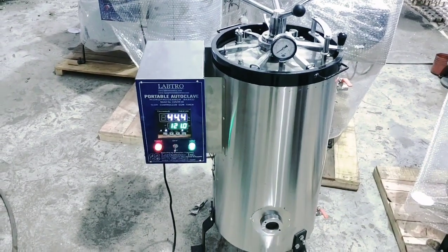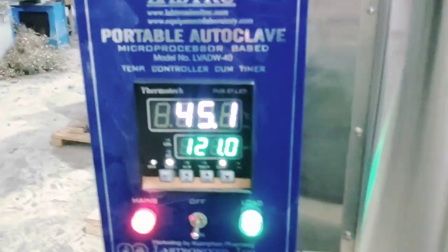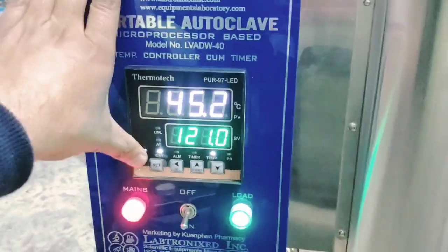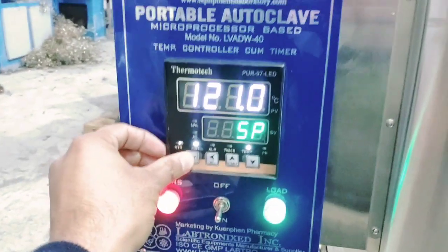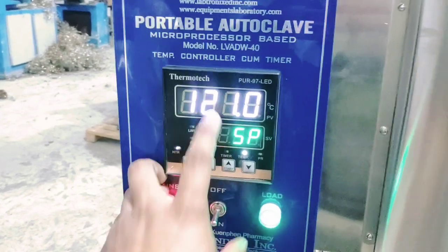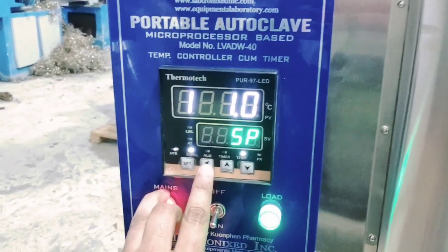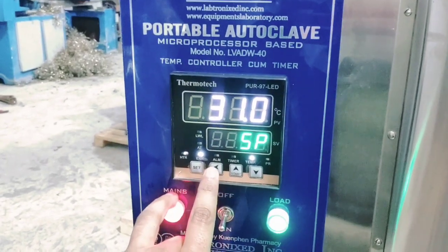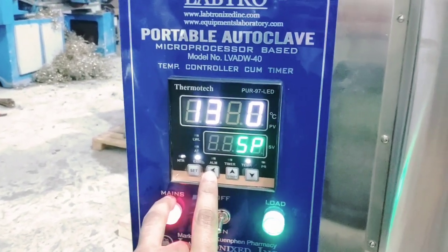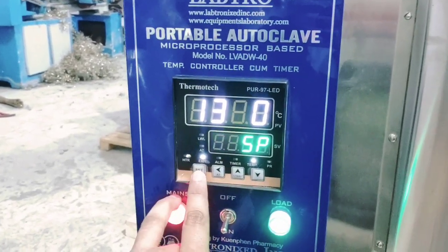Now it's done. Also again, we can change the temperature — like if we need 134. Now press the set button, then this, now 130, up, 130 — then press set. Okay, then increase to 134, okay, then set button.